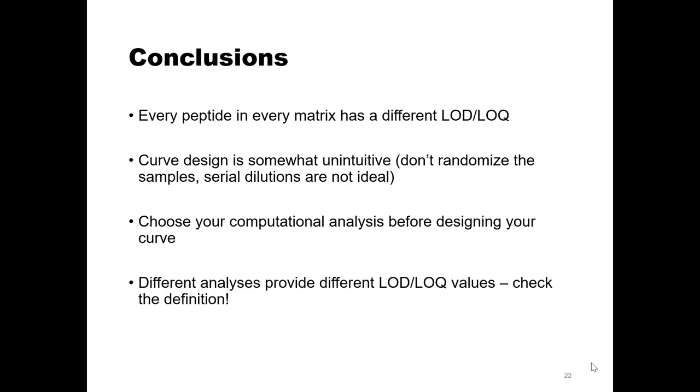Yeah, I usually do pretty small experiments, like maybe 20 samples or something, so I don't really do full calibration curves. You can get around doing full calibration curves by using a few levels, so low, medium, and high, where the low is very close to your lower limit of quantitation, and your upper is near your upper, and then one in the middle. And as long as those values adhere to the same trend line that your statistical curve generates, then you'll be able to say, all right, this sample set is running comparable to these when they're in the curve, or like the next curve.